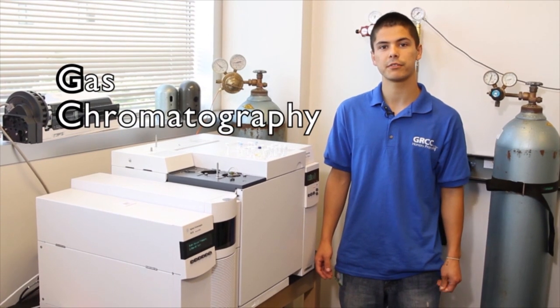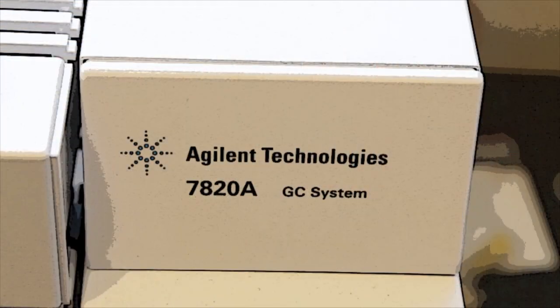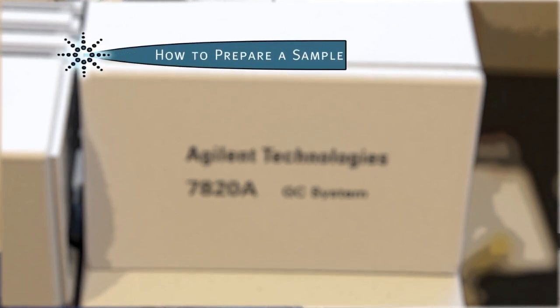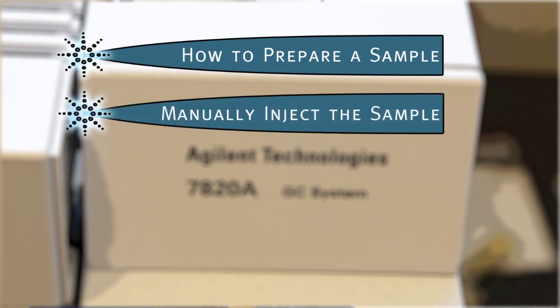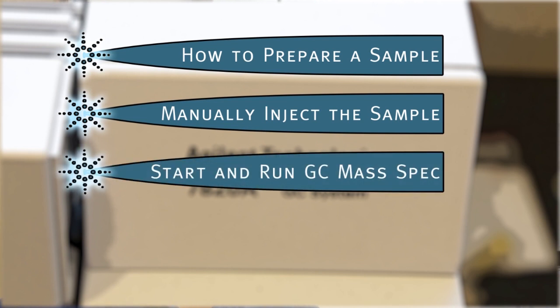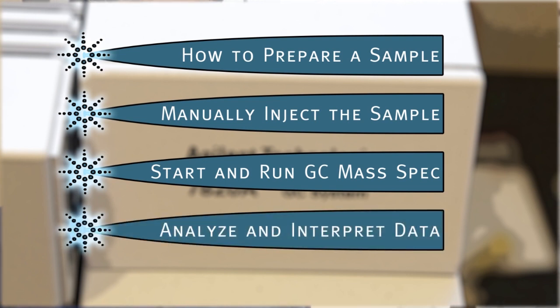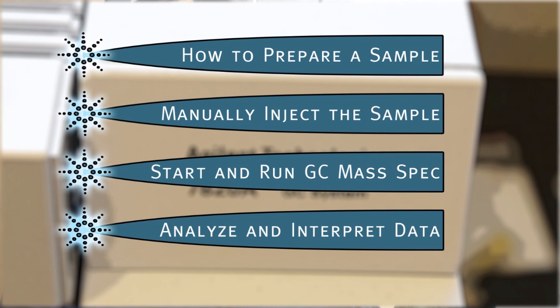Hello, my name is Corbin and today I'll be showing you GC MassSpec, which stands for Gas Chromatography Mass Spectroscopy. Today I'll be covering how to prepare a sample to run through the GC MassSpec, how to inject a sample, how to start the GC MassSpec, and I'll show you the program to do that. The final thing will be to analyze and interpret your data, because that's the most important thing — you want to know what the sample is that you've just prepared.